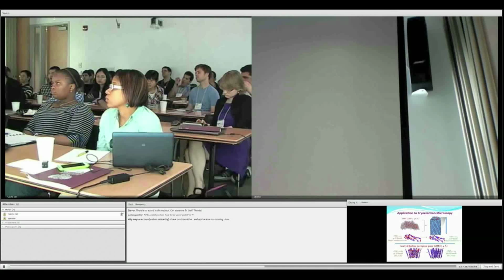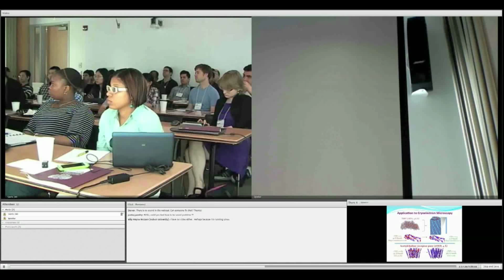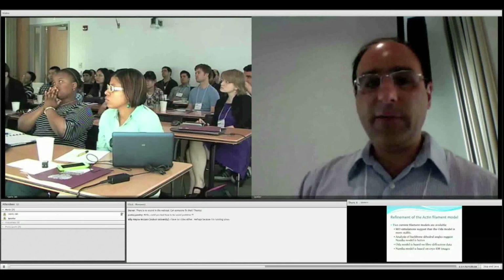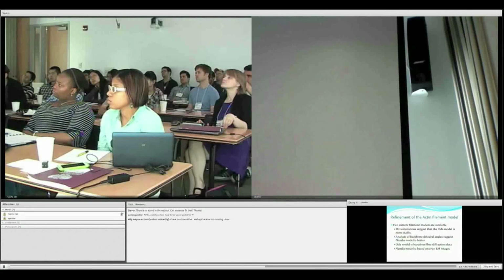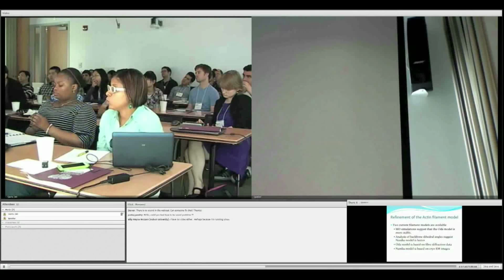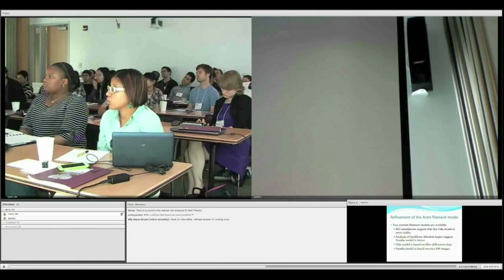Okay. So what I talked about so far was for crystallography. Another very important aspect of this work is application to cryo-EM, where you have very low resolution data. Two examples that I'm showing here. This is the tobacco mosaic virus. This is the monomer, and here you can see the whole filament. If I run the monomer through the server, I gain about twice as many H bonds.